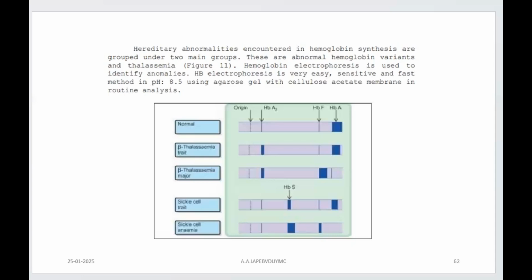Now, the protocol, of course, is an electrophoretic process, right? But it is talking about hemoglobin, so it's a protein. Fine. Now, what we are talking about is an application. We are not asking you the method. We are to just refer to the method for its purpose of application.